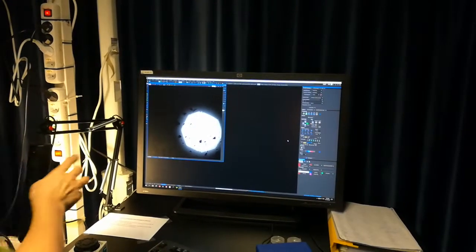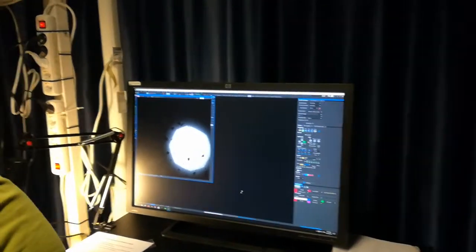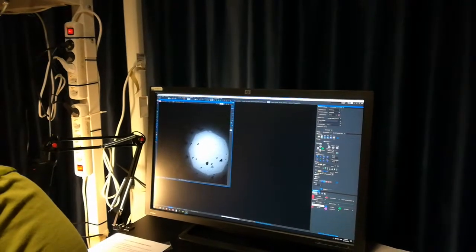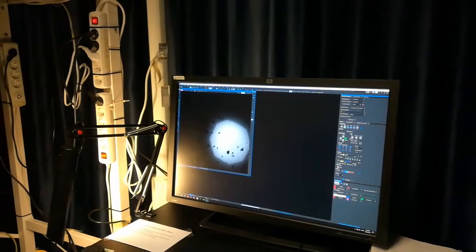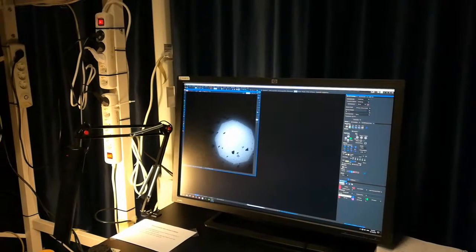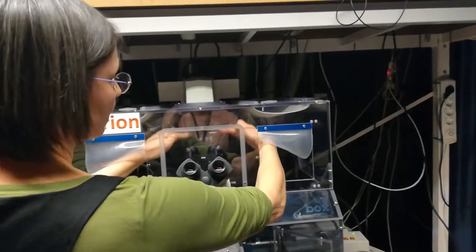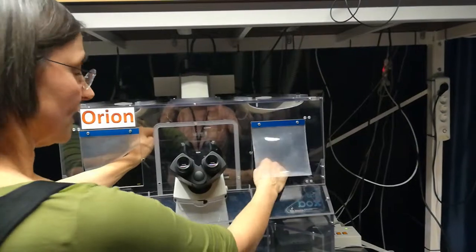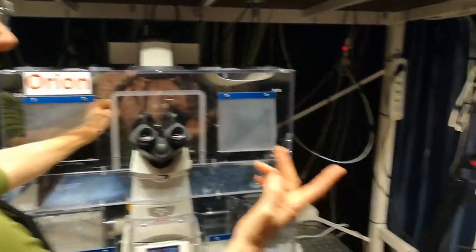It looks a little bit saturated here only because I have pushed the brightness and contrast — I can reset this. Now you can see the shadow of the field stop, which is closed. That means that my condenser is now at the correct position in Z — it's at the correct height. Once the condenser is at the correct position like this, I also need to bring it in XY at the correct position so that it's centered. And you can see quite clearly on the screen that it is not in the center.